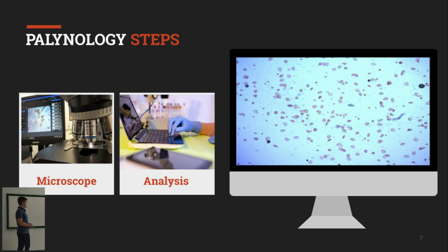The palynologist needs a microscope and a computer with a spreadsheet, or if he or she doesn't have a computer, a piece of paper with a table to note what are the species or the pollen types of the pollen grains inside the sample. He needs to count: this pollen is pollen A, this pollen is pollen B, this pollen is pollen C, etc., with a lot of samples.